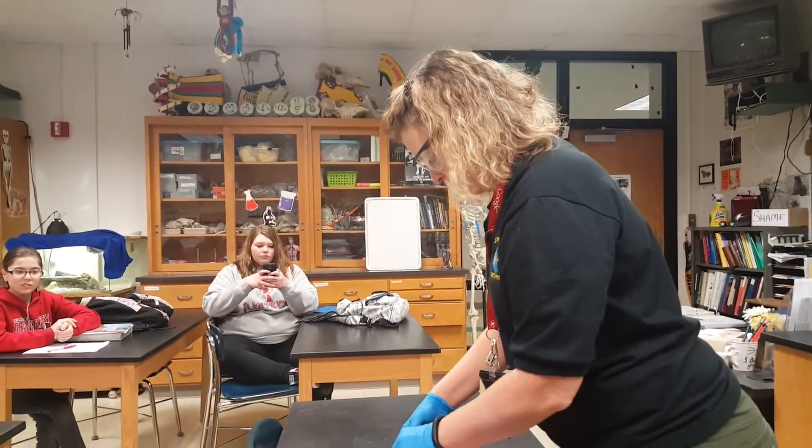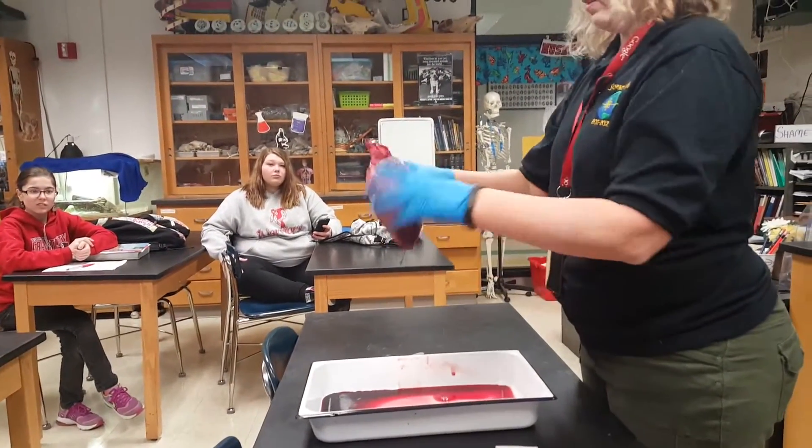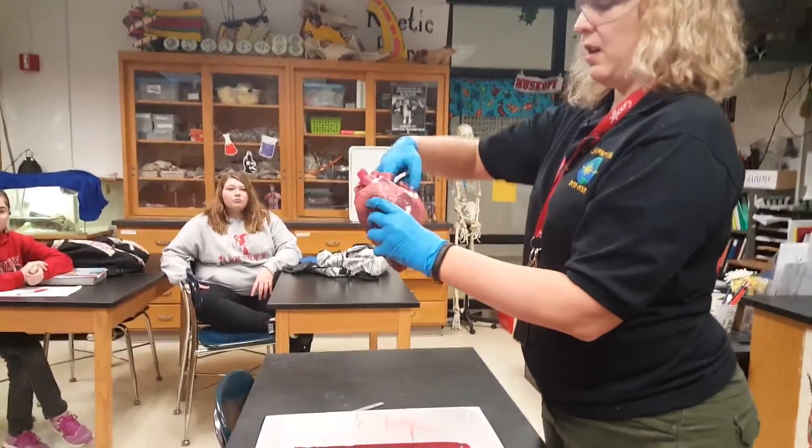That's huge. That's an auricle, right? Yeah, there it is. So: vena cava, pulmonary vein, aorta, pulmonary artery.